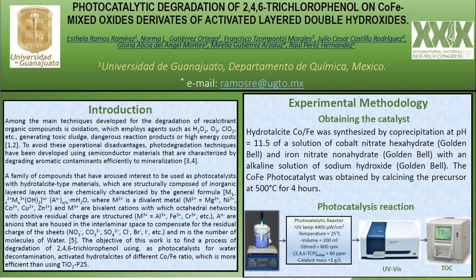In all cases, the process of degradation of the contaminant was monitored by sampling aliquots of the reactor with the subsequent quantification of this in a Cary 100 UV spectrophotometer at a wavelength of 311 nanometers.